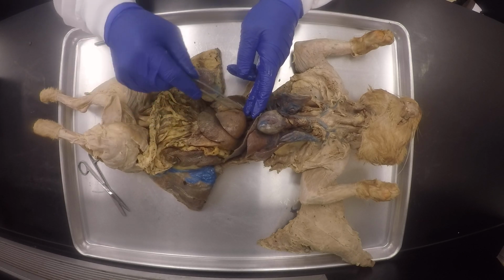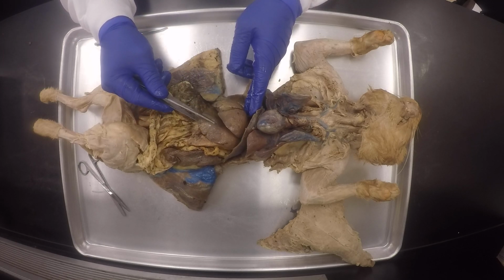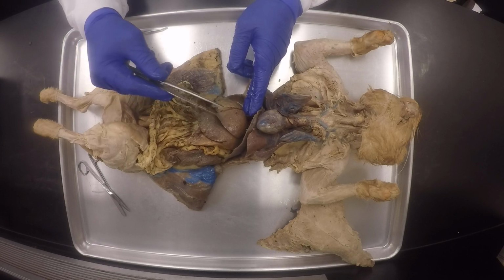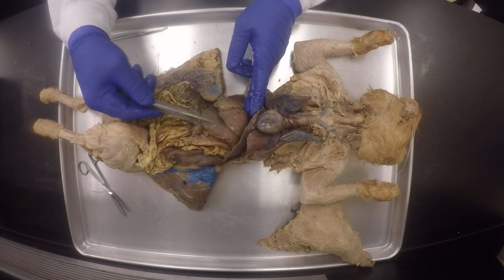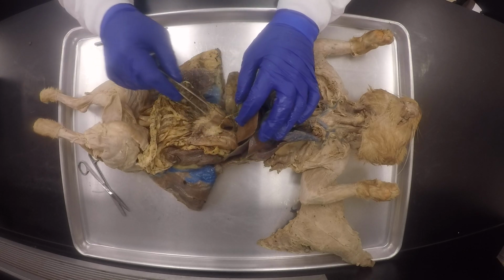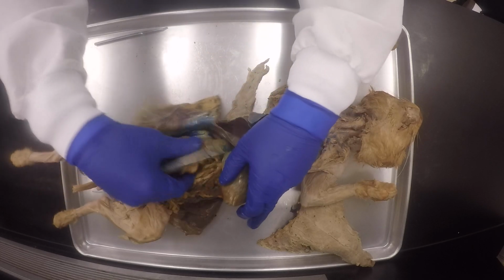Left median lobe. The left median lobe is actually smaller than it appears, like the left lateral lobe. You know what I'm saying? But the left lobe is really small, just like in the human. You see what I'm saying? So the left median lobe, left lateral lobe, right median lobe, and then caudate lobe. That's four, right? We need the fifth. So we have to plow it down.